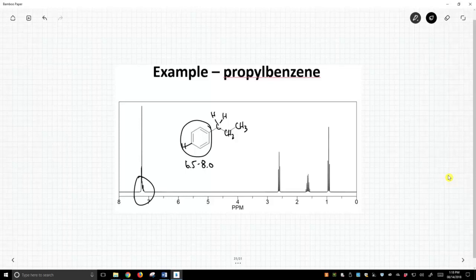This CH2 has two neighbors. These should be a triplet. This CH2 is flanked by not only that CH3, but that CH2. This thing has five neighbors. That's a big one. So the multiplicity equals six. That's that one right there. This one's a triplet.